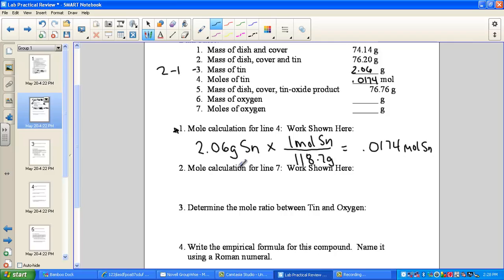at your desk. Now remember, you were instructed to cook it so long that the tin oxide product actually turns a little bit yellow. It starts kind of as a white powder after you pour the acid on, but cook it strong enough until you see that canary yellow. Not a little yellow, but a lot of yellow.